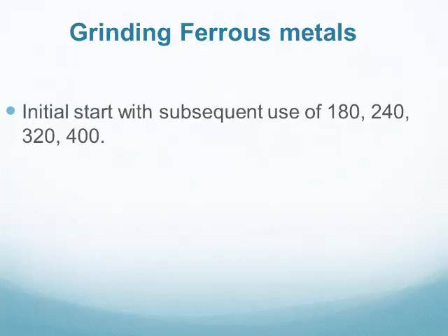After cutting, you should start grinding with the paper 180. After 5 minutes of grinding this paper, you will change to the next paper with 240.